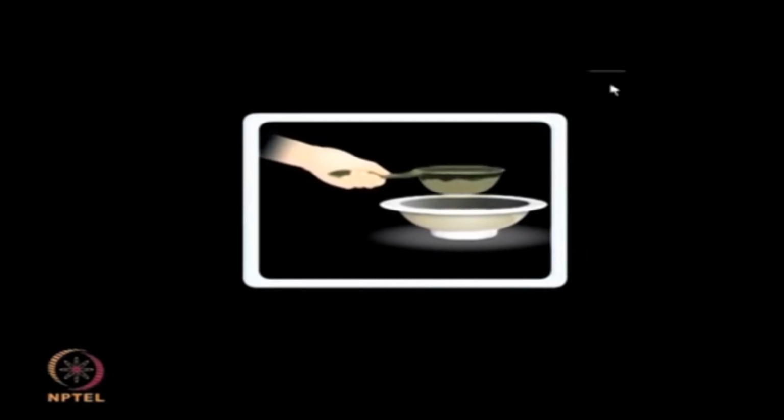Let me give you an analogy of gel filtration with a sieve. This process is very similar to separation of small particulate matter from food grains using a sieve. The larger grains remain behind the sieve, while the smaller sand or stone particles pass through and are removed. In keeping with this, the gel filtration technique is also commonly referred to as molecular sieve.